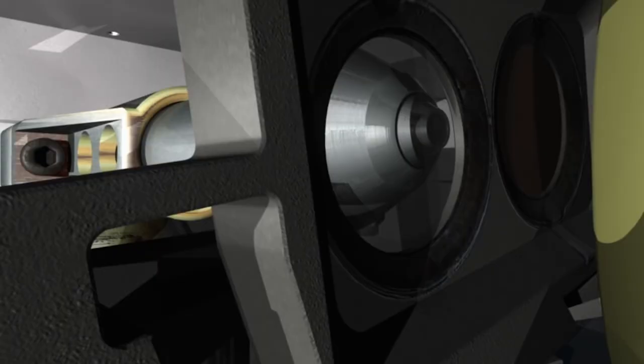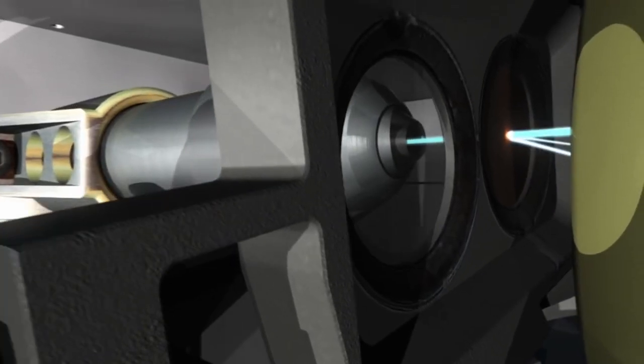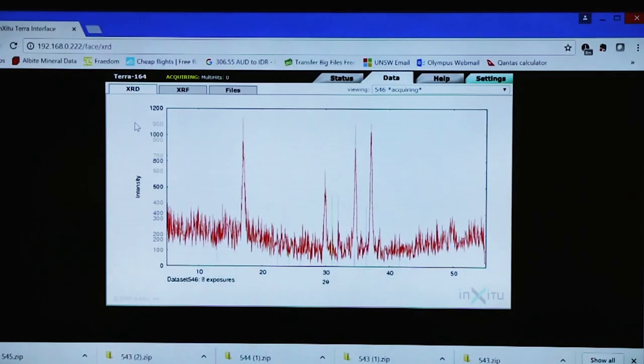It's awesome that we've got this equipment from Olympus because it allows us to actually analyze the samples in real time.